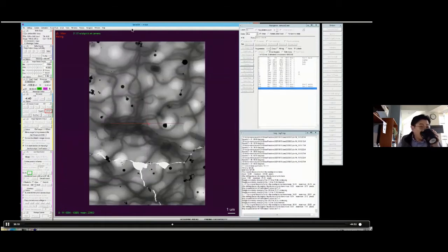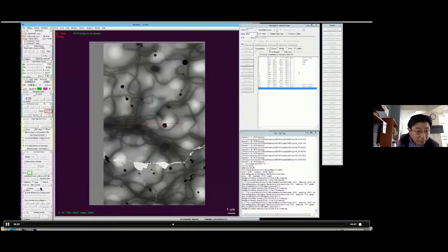There's one question we just got. I missed if you're using an energy filter for data collection. Oh, yeah. We have an energy filter in, and I don't think we have a camera here. The energy filter is in.